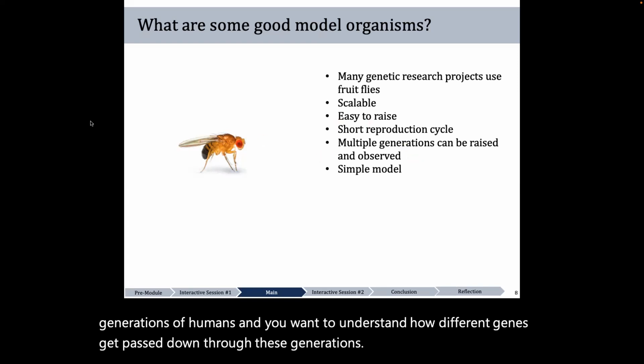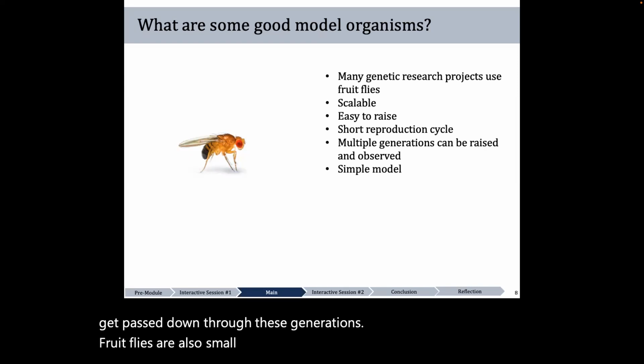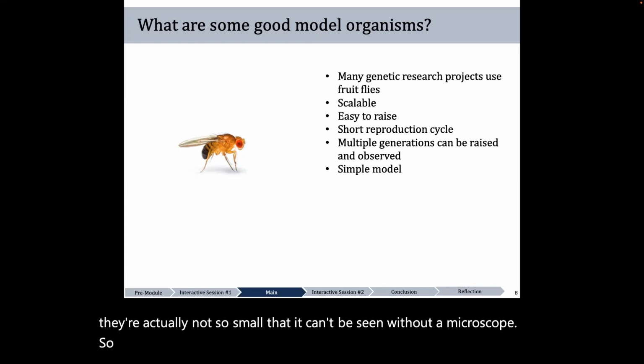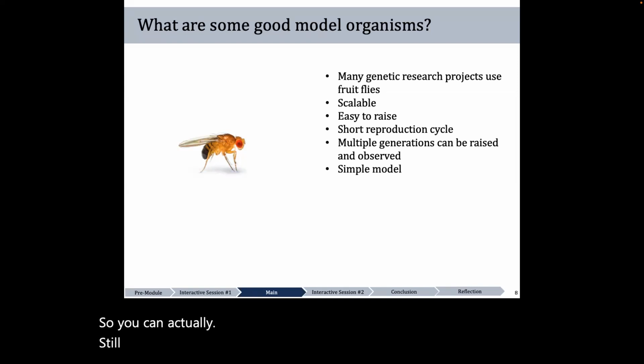Fruit flies are also small. They're about 3 millimeters long, but they're not so small that they can't be seen without a microscope. So you can actually still feed them even without a microscope, and that makes them easy to take care of.